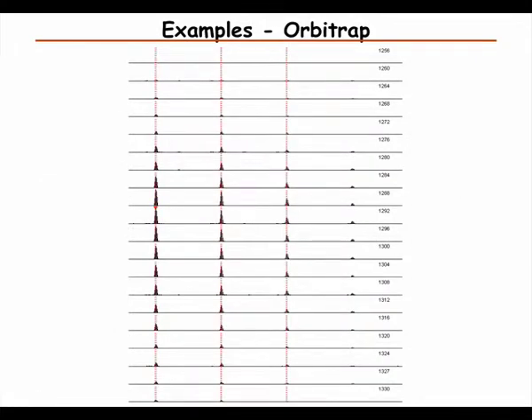Then if we go to a more high resolution instrument, we get a better separation between the peaks, and the chance for interference goes down.